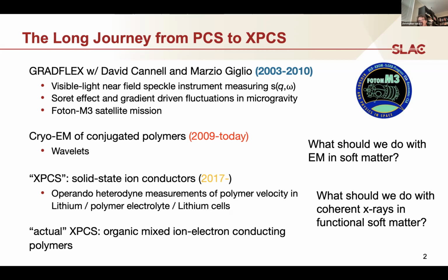I went to doing cryo-EM of conjugated polymers, where it turns out that mathematically, cryo-EM and high-resolution TEM of polymers is effectively identical to near-field speckle instrumentation, except in real space, where you start to have much higher order correlations in materials spatially that go across scale, and that's what we observe and try to understand.